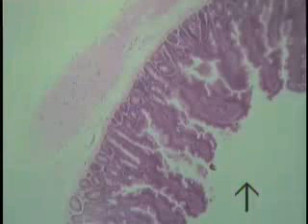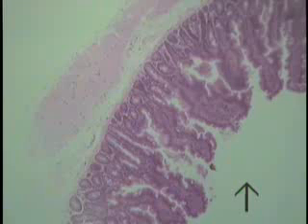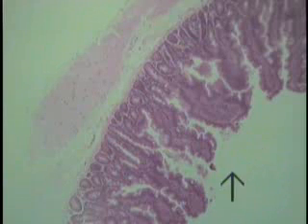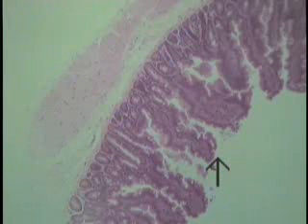When examining tissues and cells, one must keep a mental profile of any cell division or mitotic profiles that are observed. An excellent place to observe mitotic activity, to familiarize oneself with the various mitotic figures, is within the small intestine. This is a section through the small intestine. The arrow indicates the position of the lumen. So the intestinal mucosa is shown here at the arrow. This is the particular region of this section one should examine.